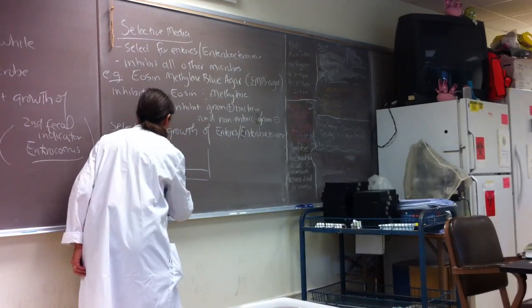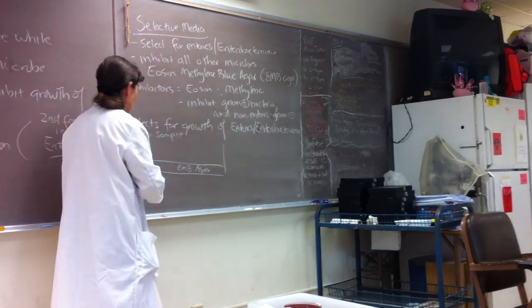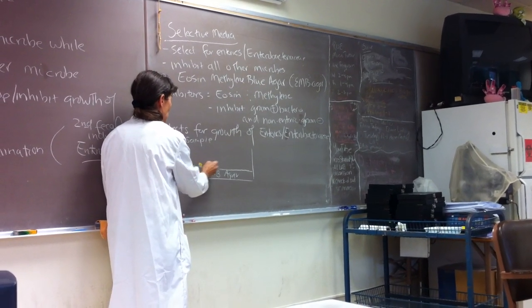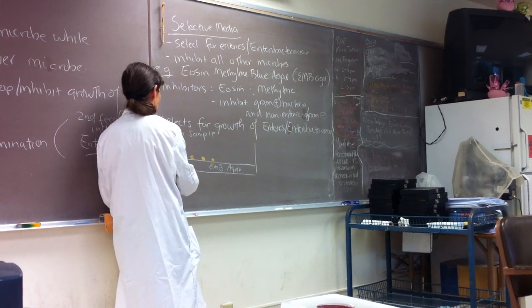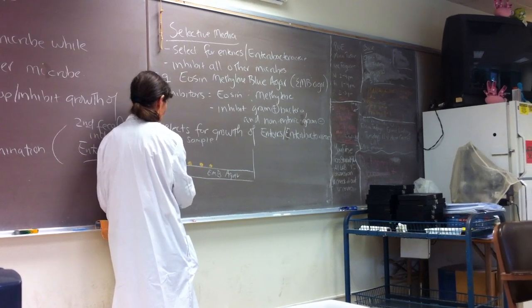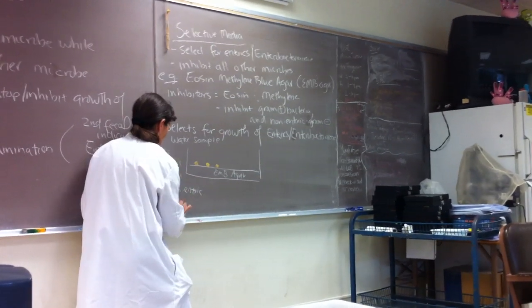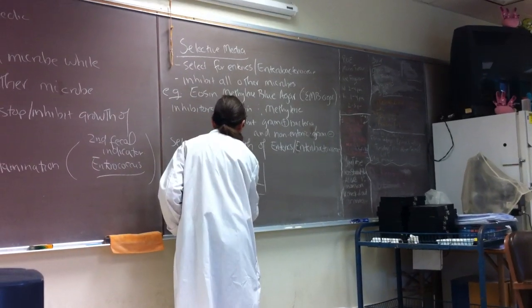say this is the EMB agar, and I'm just going to make this up, you guys. Let's say the Enterobacteriaceae bacteria are all put in orange, okay? And obviously they're making them much bigger than they should be. So the enterics will be in orange. And let's say the non-enterics will be in white. Okay, and there's a mixture of both of them in a well water sample.